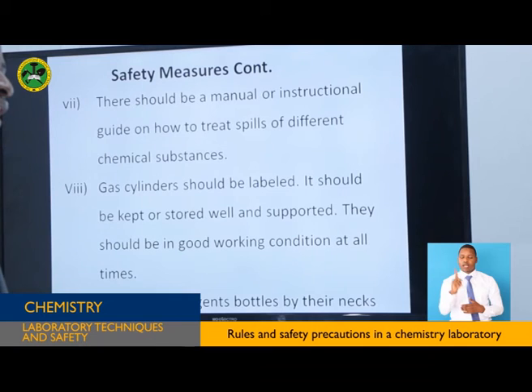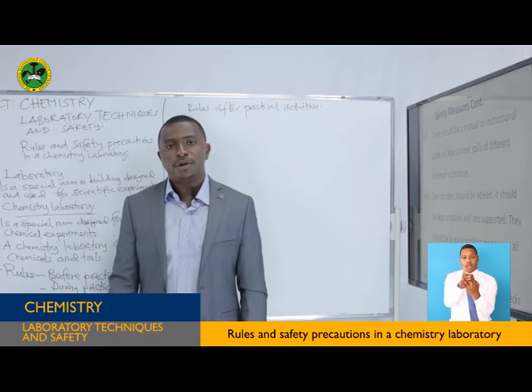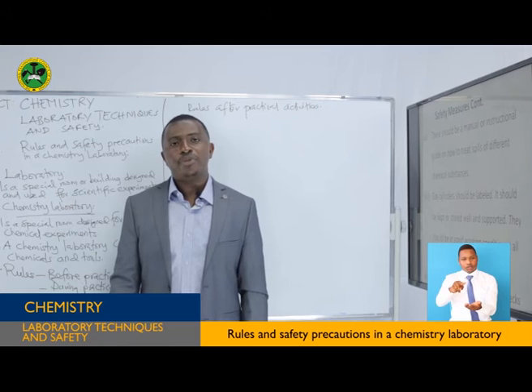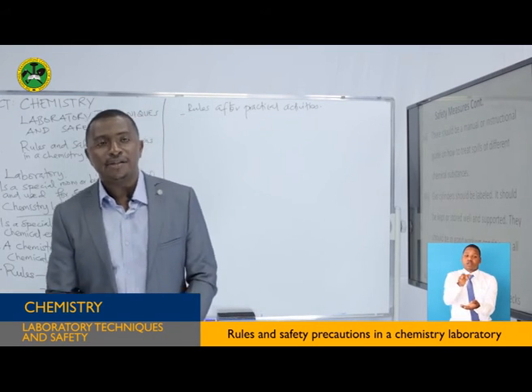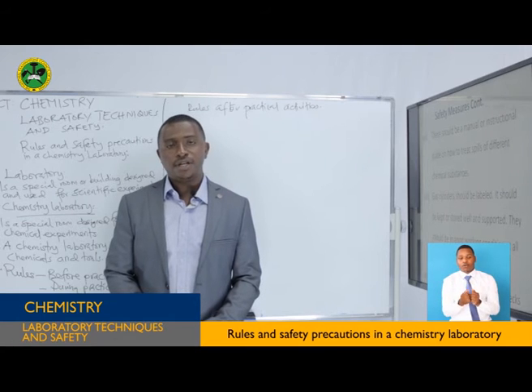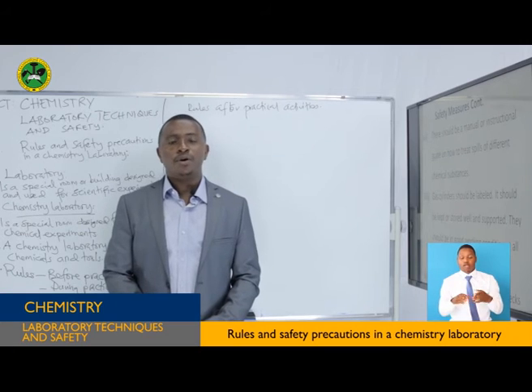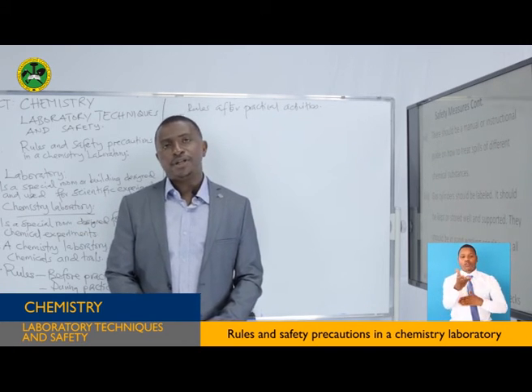Never carry reagent bottles by their neck. This is also very important, because carrying reagent bottles by their neck can result in breakage of the apparatus, and then it will result in an accident whereby that specific chemical can burn you, or the broken glassware can cut you.